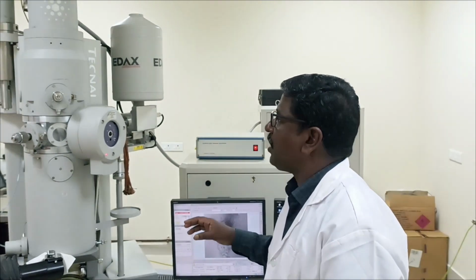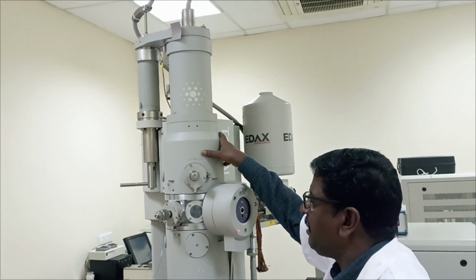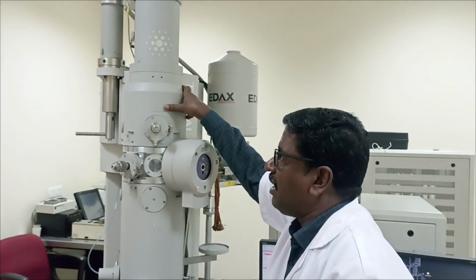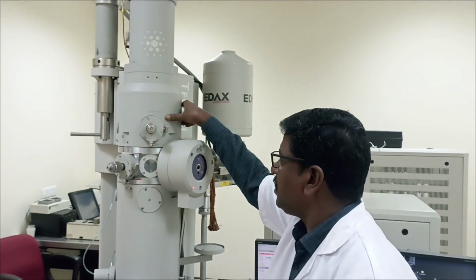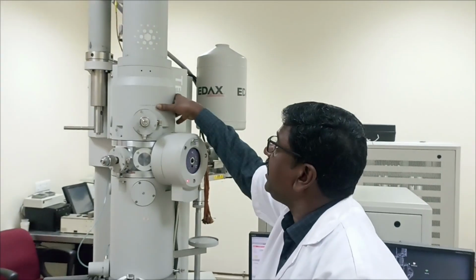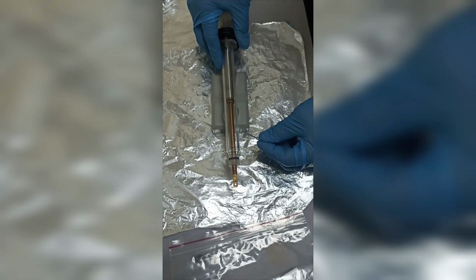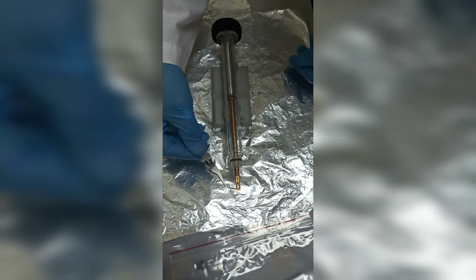And the next important thing is that the electron column should always be kept under vacuum, to avoid any dust material. If dust material is here, that will hinder the electrons' movement, so the electron column is always kept under vacuum. In that cavity we are going to keep the copper grid, wherein we keep the sample, and the copper grid.